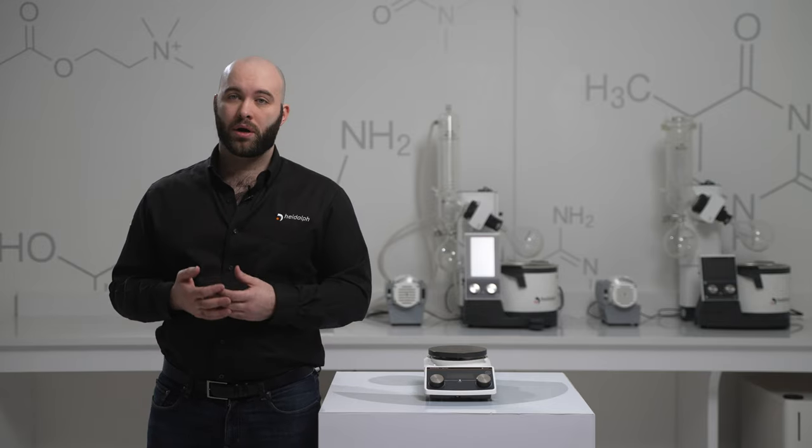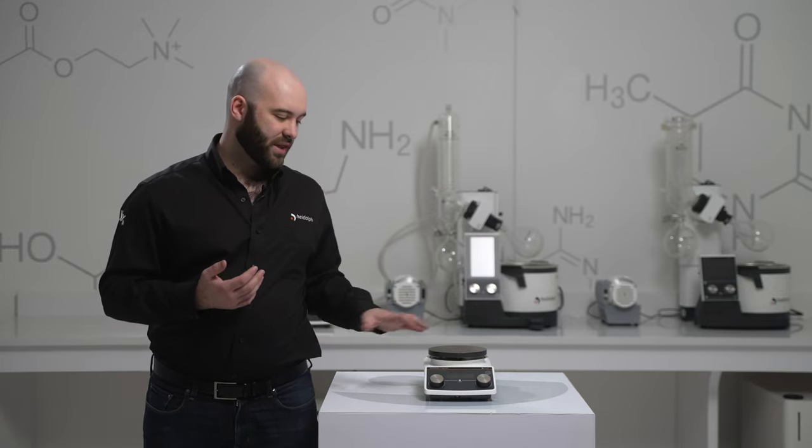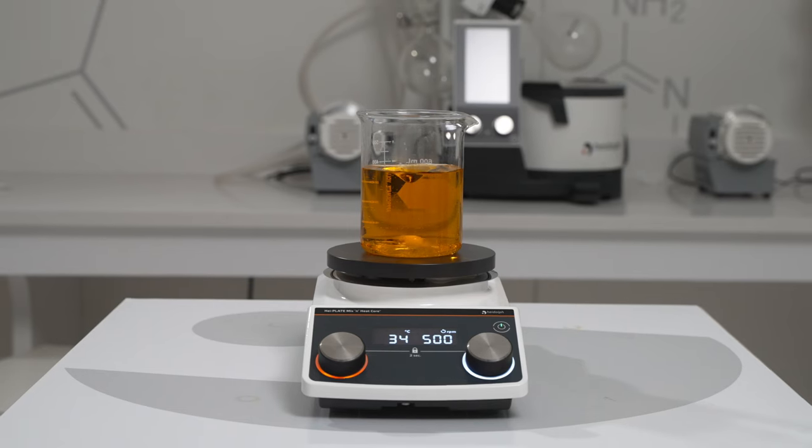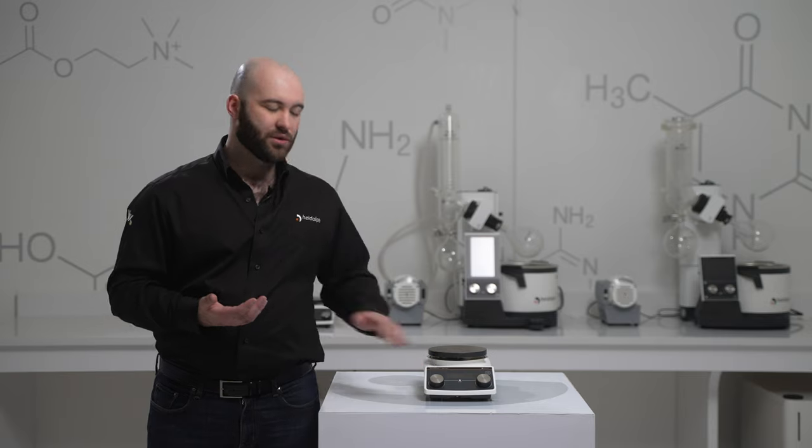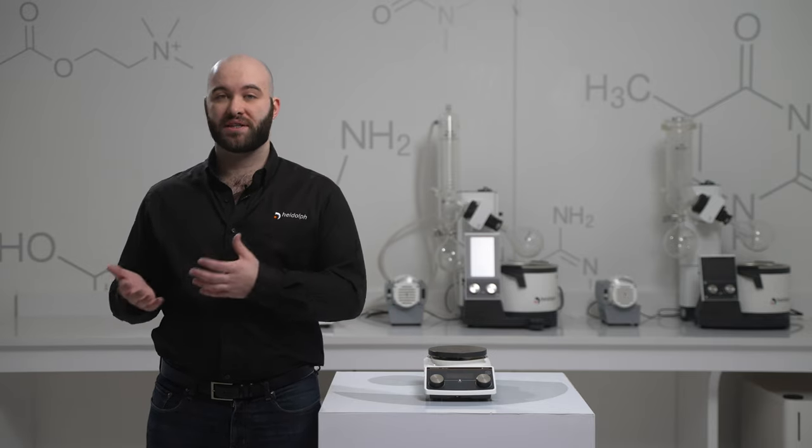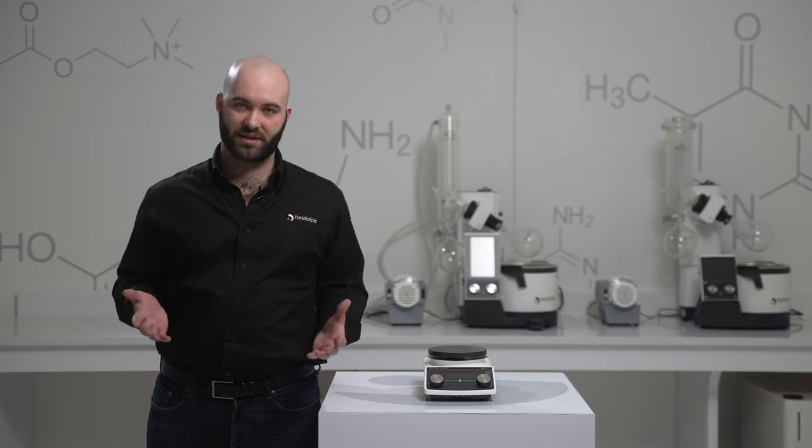The hotplate core plus continues to use the PT-1000 thanks to the digital nature of the hotplate. So from your screen you can see what your process temperature is, and it still continues to have the fast versus precise heat up mode so you can have better control of the heating of your process.